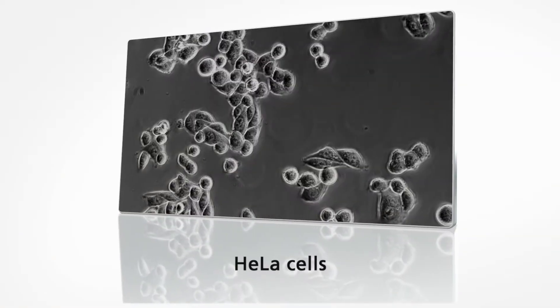The result is PrimoWert, developed by Zeiss with you in mind. This compact microscope is perfect for quick checks on living cells.